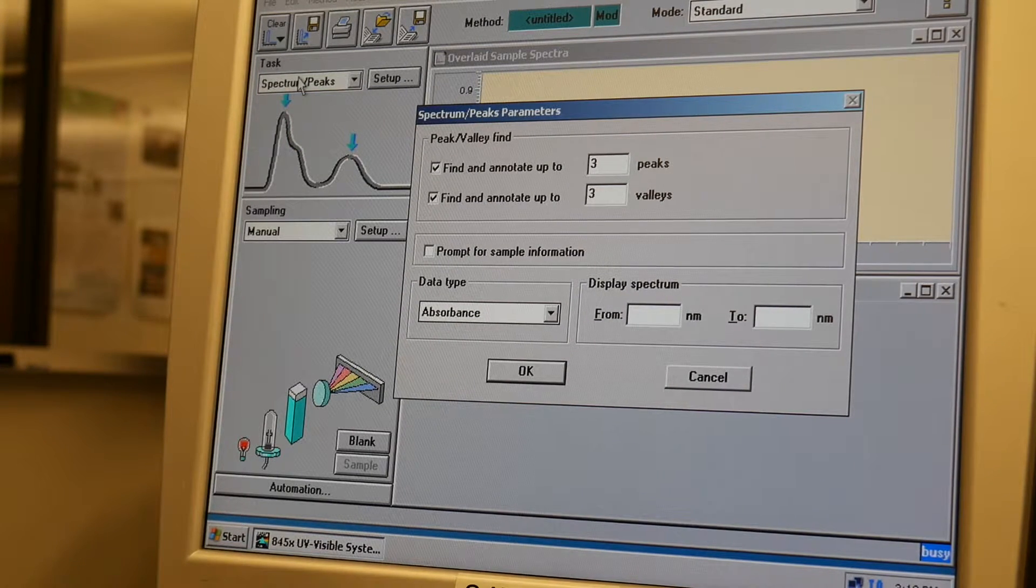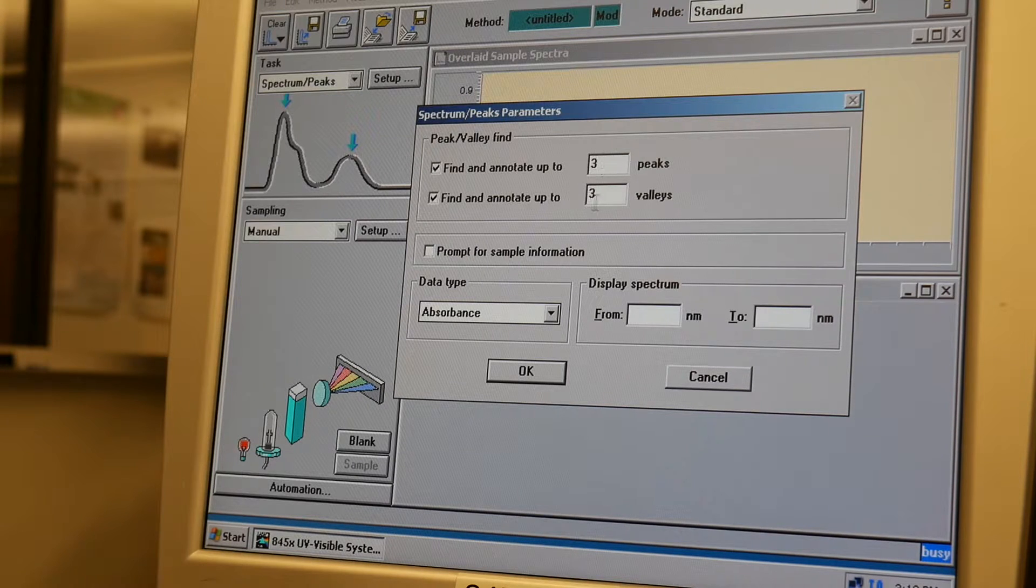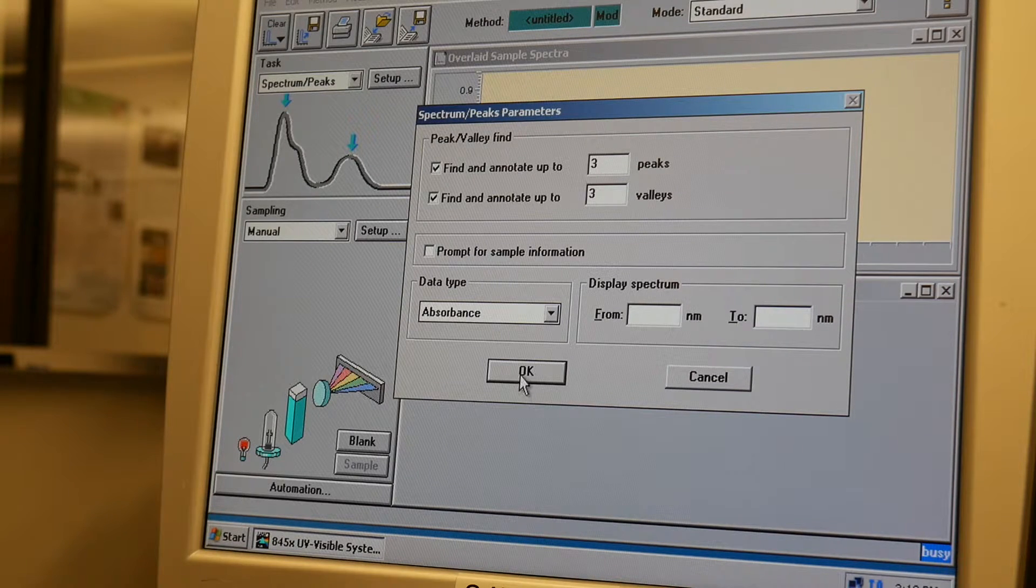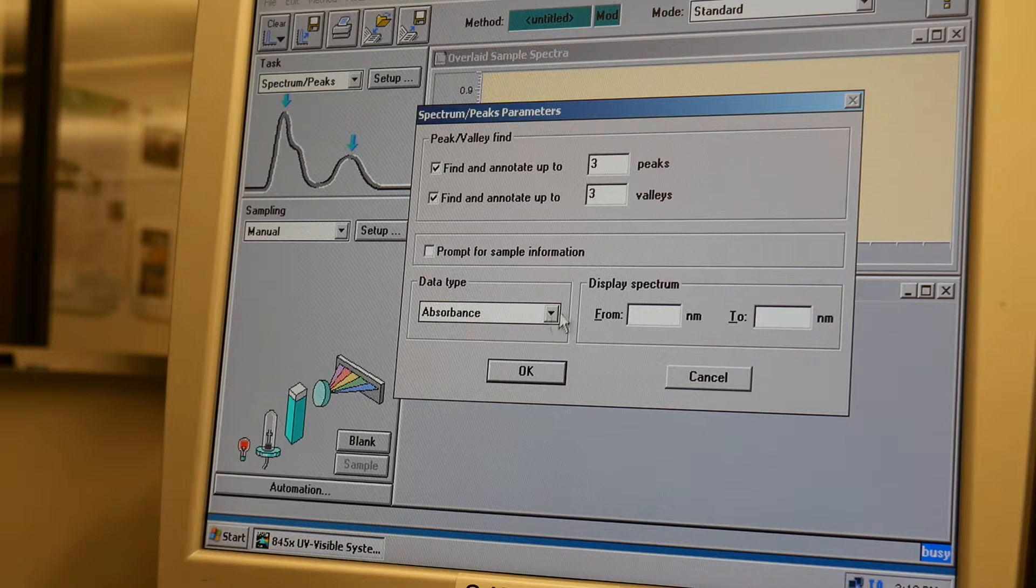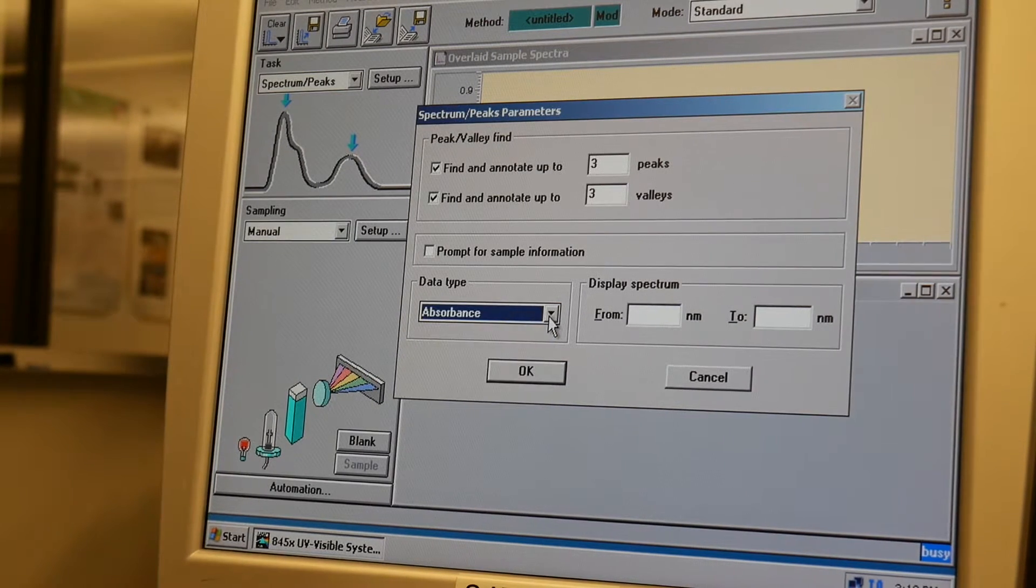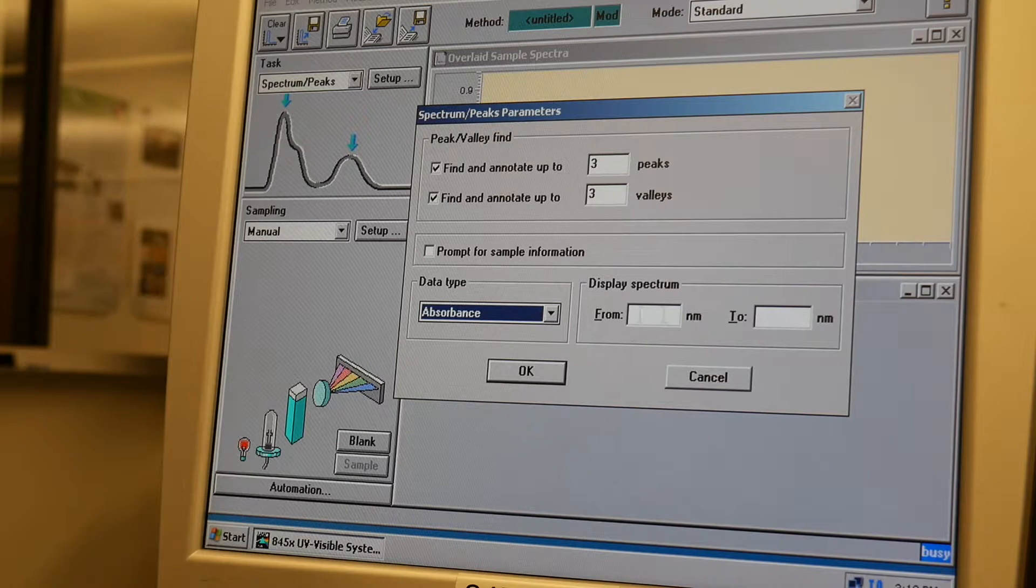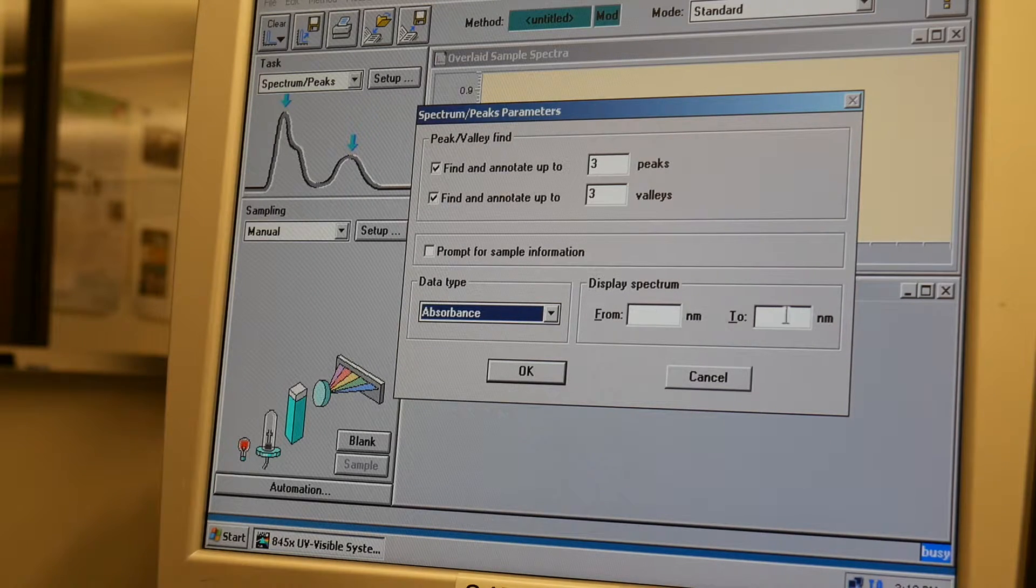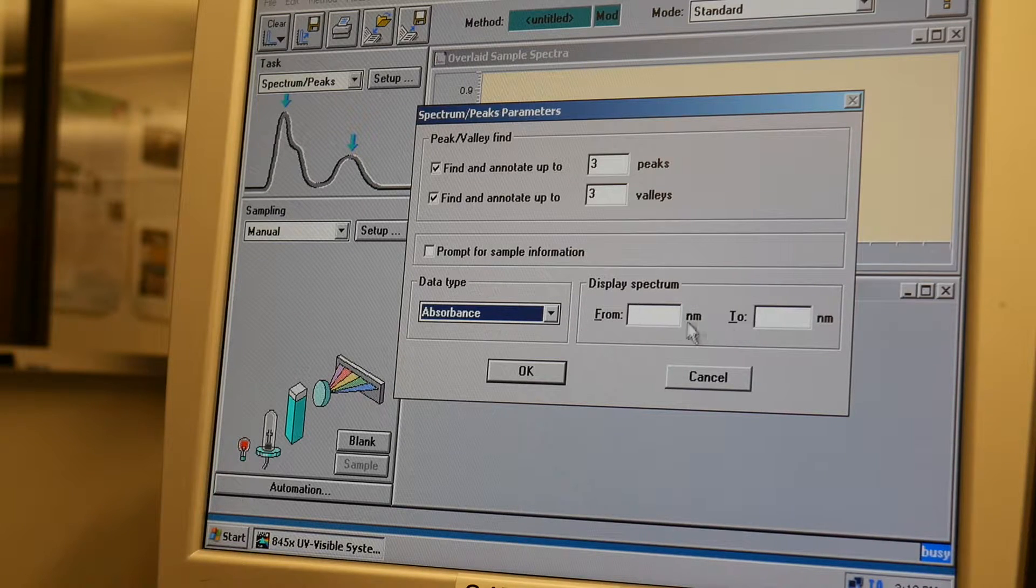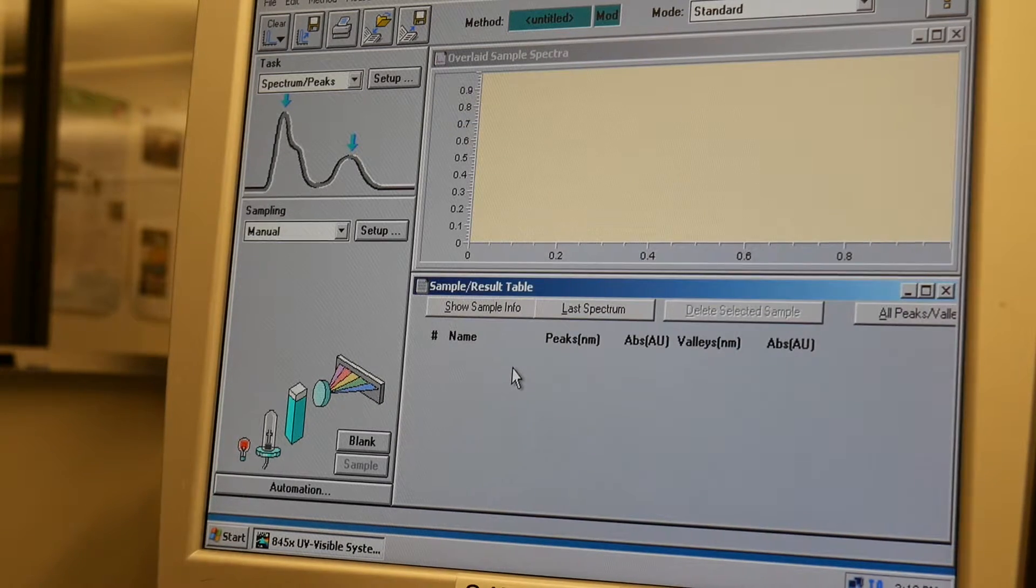And what we're going to do here is it's looking for three peaks, and we're going to click OK. We want absorbance rather than transmittance. If you want to limit the spectrum, then you're going to fill in the bounds for your wavelengths. But I'm just going to put OK for now.